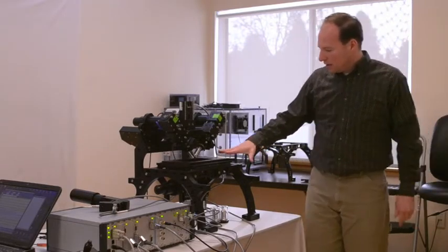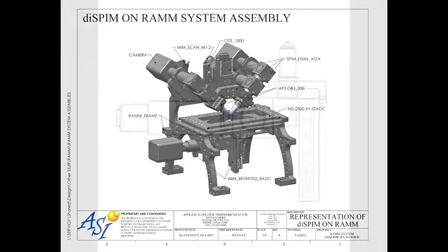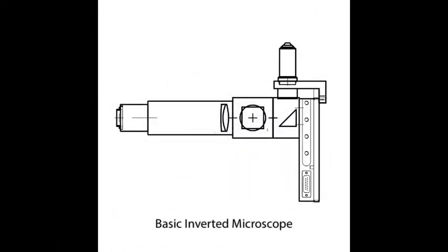So this is mounted on an inverted microscope. In this case, it's shown on a RAM, ASI's RAM frame, and a very minimalist inverted microscope consisting of a motorized objective mover, a port for epi illumination, and a tube lens where a camera would be mounted.